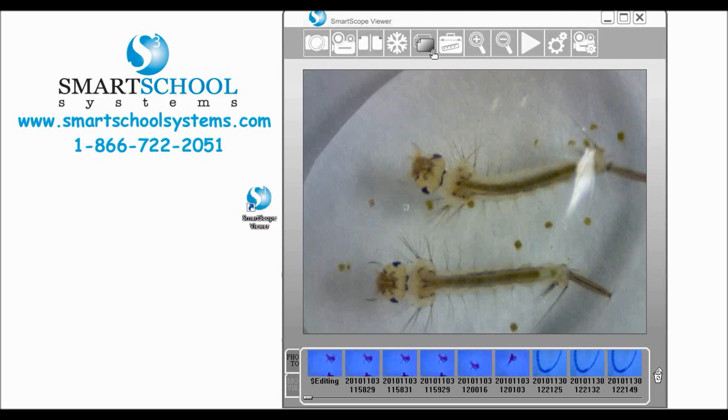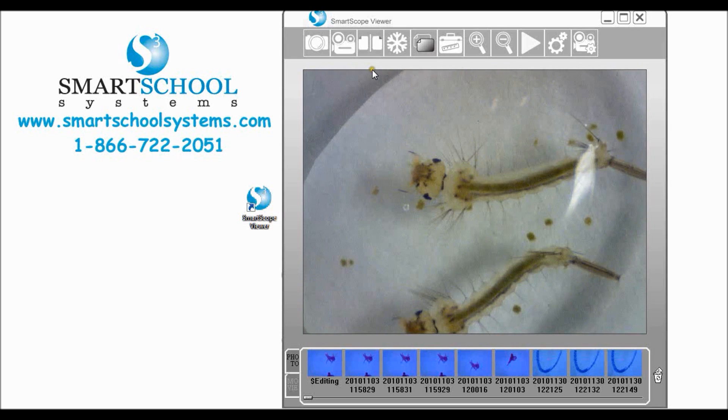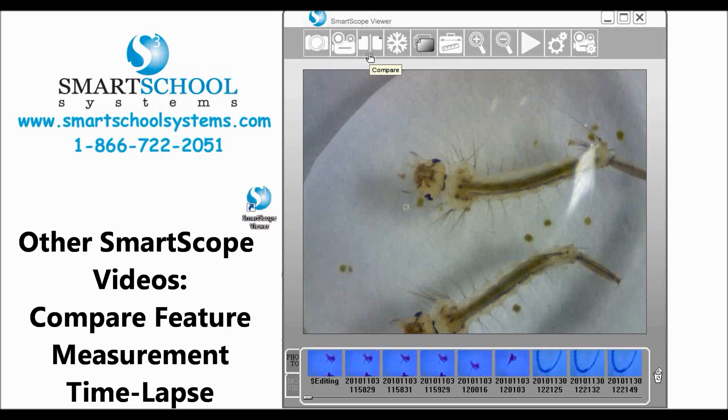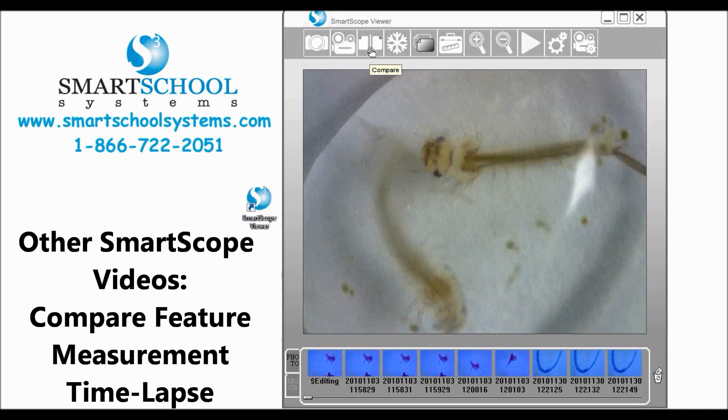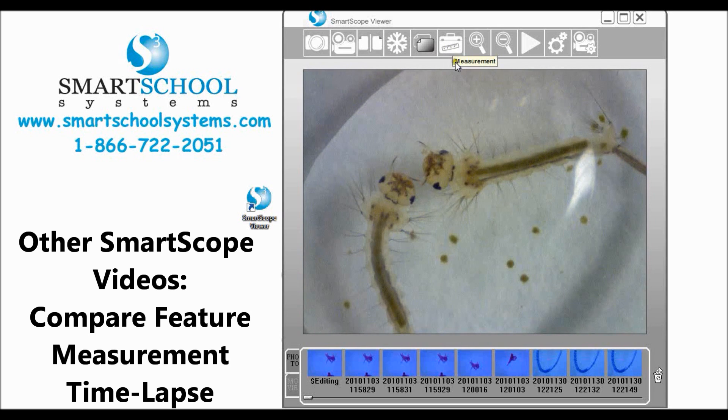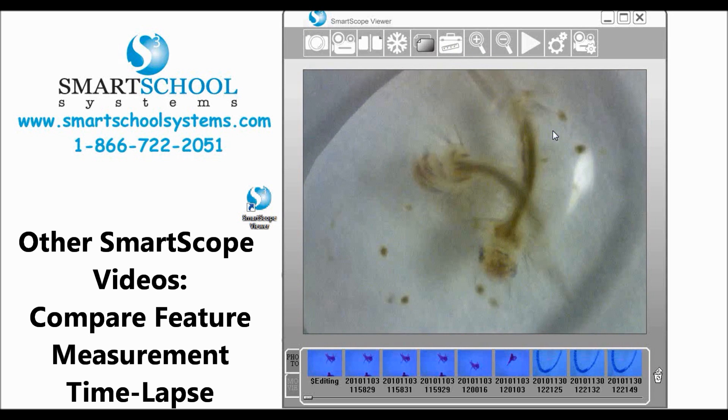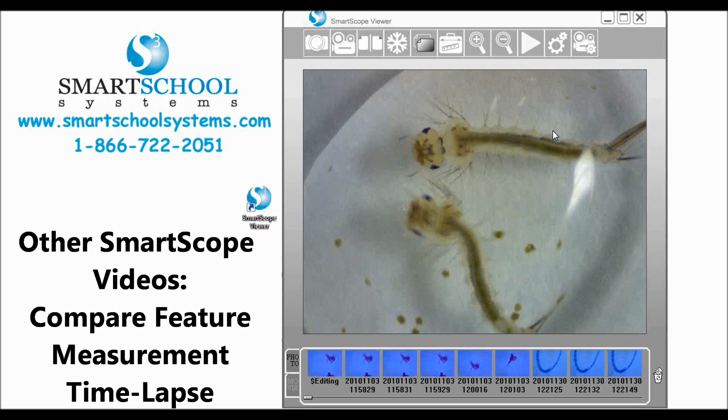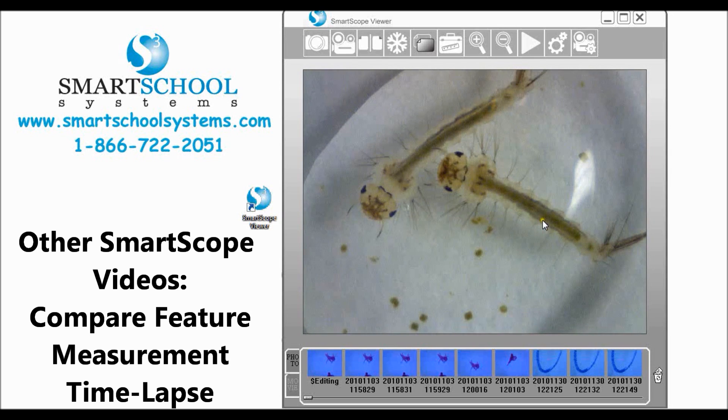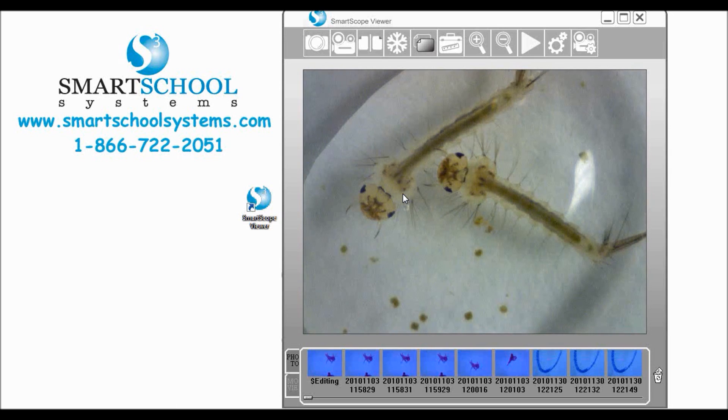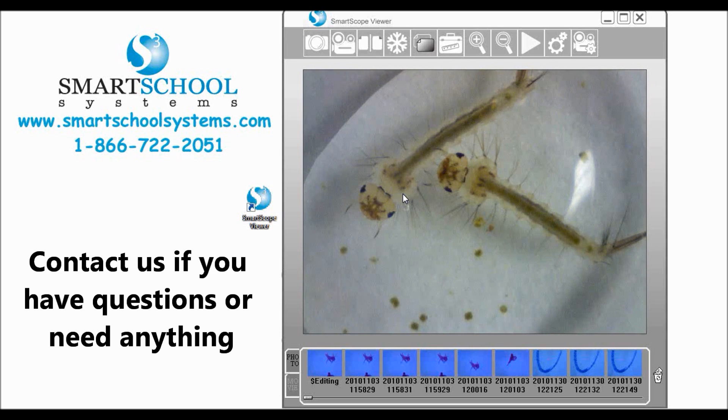Okay so that's about it for the basics of the SmartScope Viewer software. There are some things we did not cover: we have a compare feature here, we have measurement, and you can also do time lapse videos with your SmartScope. We have additional videos on those topics specifically.